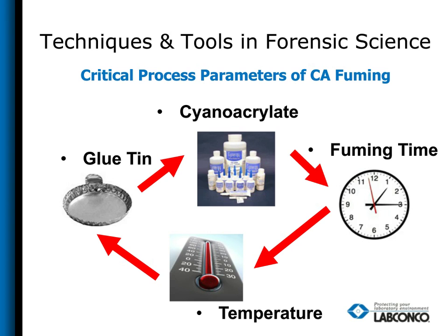We found in research, working on some different projects, that heat sources from one to another are very inconsistent in their output. Being able to verify consistency in this temperature, and the same increase in temperature each time, is very important for a consistent, repeatable result.